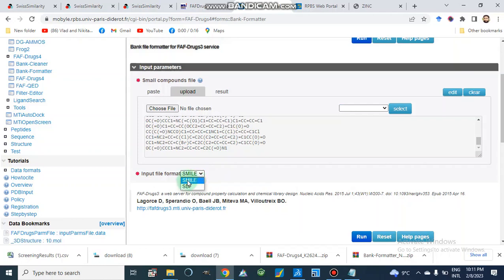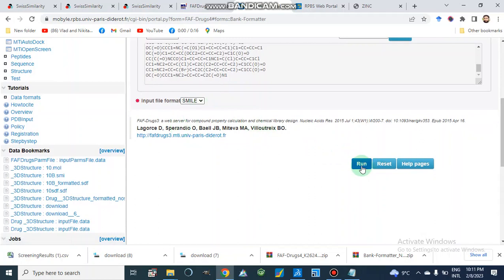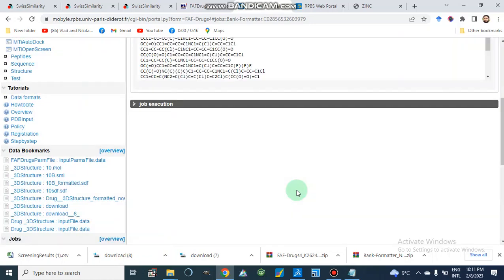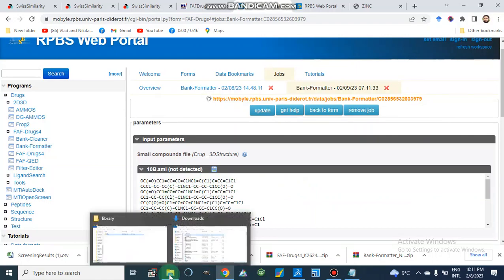Bank formatter accepts SDF or SMILES file formats. We will select what our input file is — either SMILES or SDF. Since we have a SMILES file, we select that option, then run the program. After running it will take some time and give us a bank formatter output file that can be used for compound screening. I have already saved this file — after the job is finished we download the results.